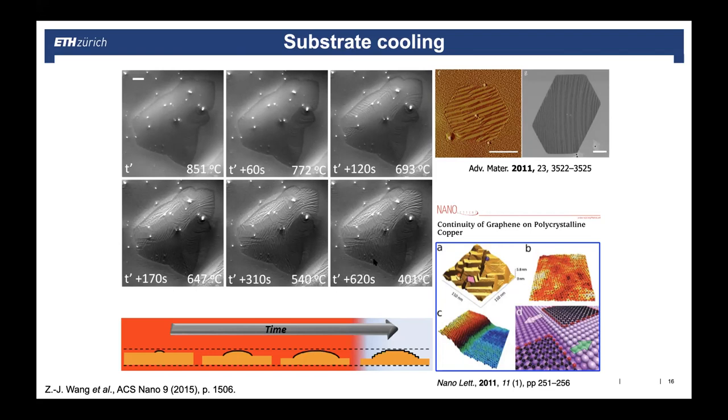There must be some species of oxygen in there. And indeed, I believe as well that there must be some oxygen in there. But if you have too much oxygen during cooling, the oxygen induces surface reconstructions. So there's a very careful balance in oxygen-induced reconstruction. You don't want to have oxide formation and so on. But the oxygen, I blame the oxygen for these reconstructions.